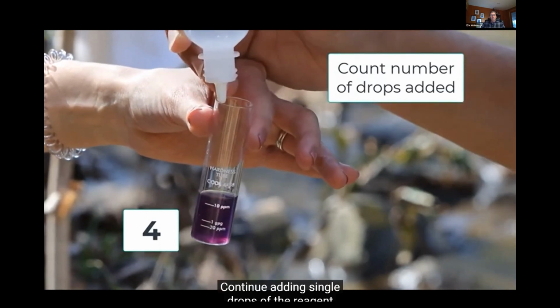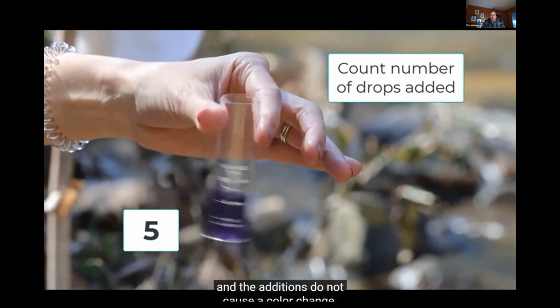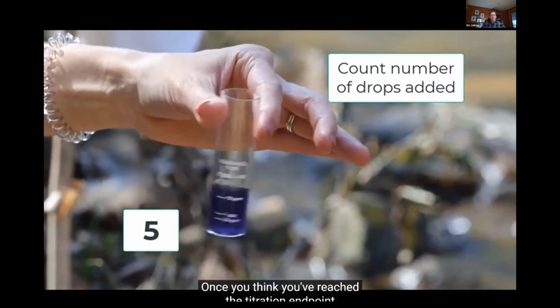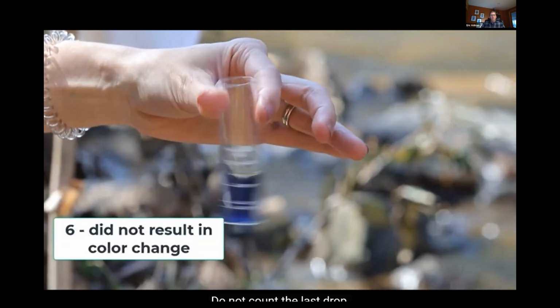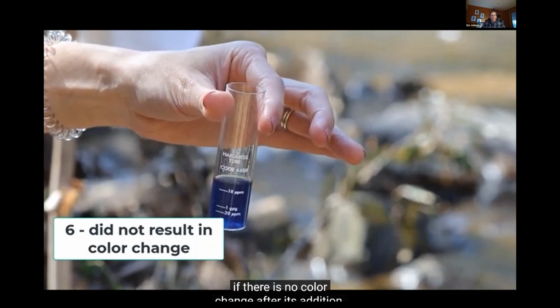Continue adding single drops of the reagent until the pink color changes to blue and the additions do not cause a color change. Once you think you've reached the titration endpoint, or the point where the color is no longer changing, add 1 more drop. Do not count the last drop if there is no color change after its addition.